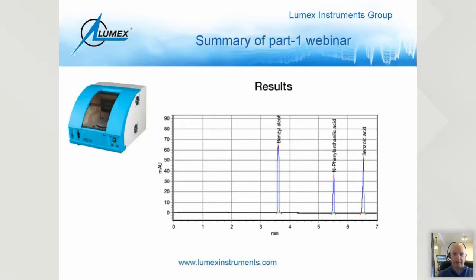Benzyl alcohol's coming in first because it's a neutral charge molecule compound. We don't have any positive compounds, but they would certainly come out before benzyl alcohol. And then after that, we have N-phenylanthranilic acid and then benzoic acid coming out. And of course, what we see here is the electropherogram that I've shown you many, many times.